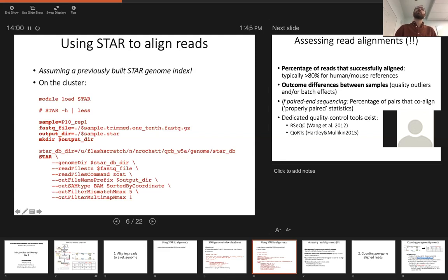And then one important parameter, maybe two important parameters. So maybe the most important parameter is this one. STAR has this weird naming option convention, where this is a filter. So it has a bunch of different filters. I would even encourage you to just go through the help. It doesn't have a manual page. Everything is in the help, so the help is fairly long. That's why you want to use it less.